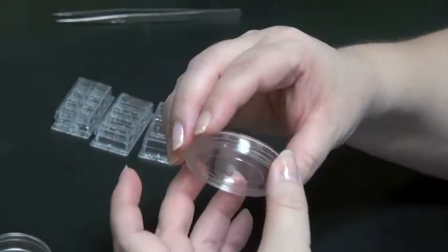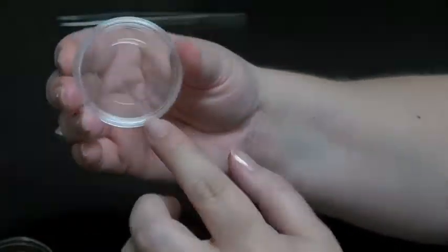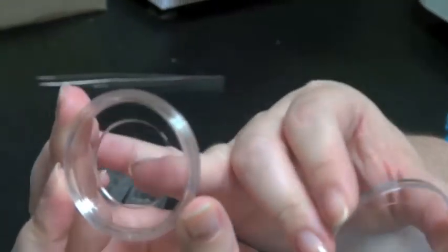Here at Clemson we have microscope objectives that are corrected for a cover slip of 0.17 millimeters thickness and so it's important that we match that.